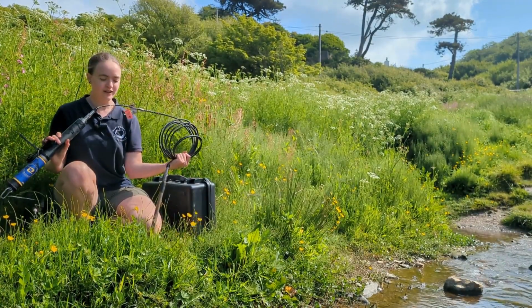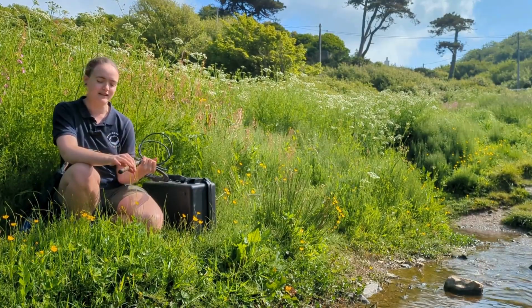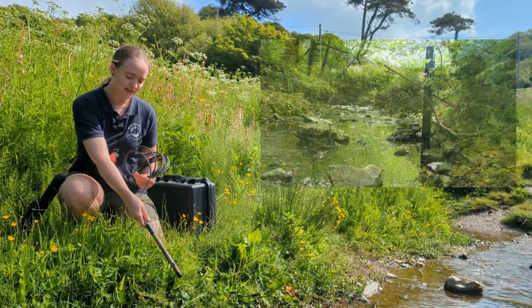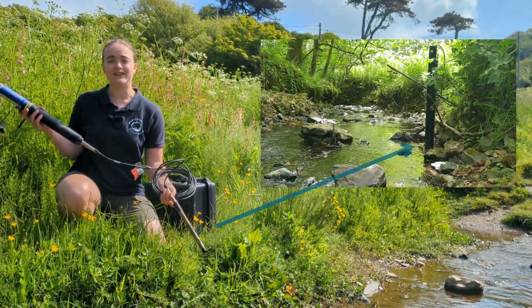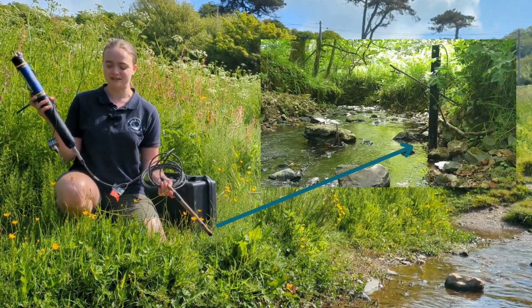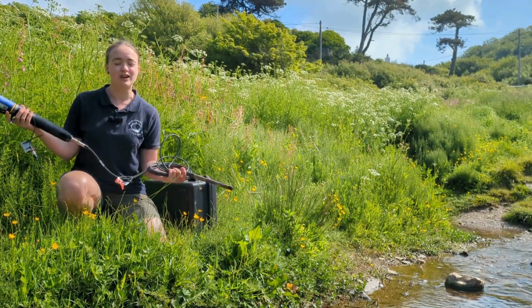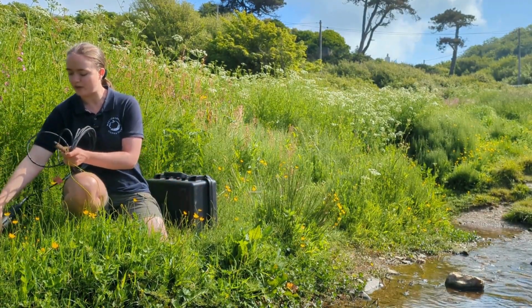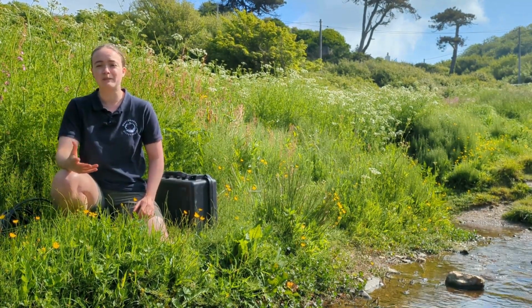So we can put a device like this in the river, and it can take measurements every 15 minutes. So this bit will sit down into the river, taking the measurements, and then this bit will sit on the bankside to send those measurements to our online system. So it's really good at reporting back over a long term. We can see how well interventions are improving water quality or where there might be issues.